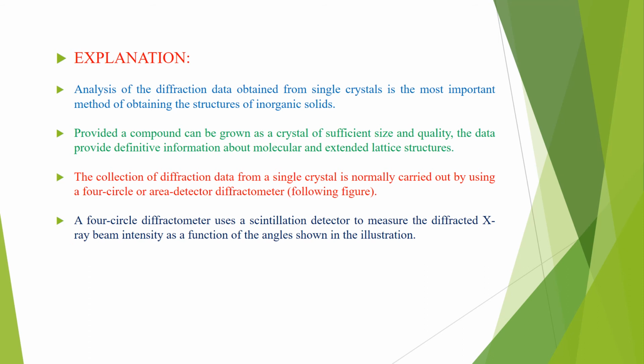So these inorganic solids and their crystals are studied by using the single crystal X-ray diffraction technique, provided a compound can be grown as a crystal of sufficient size and quality.